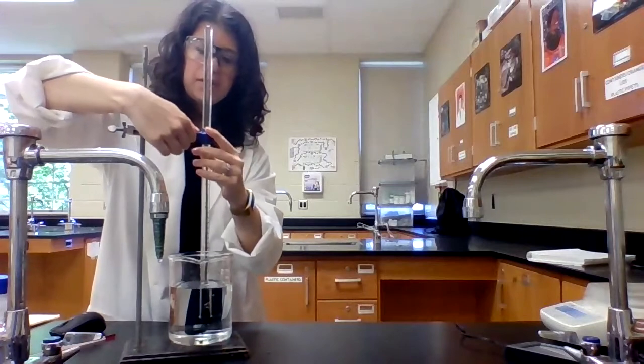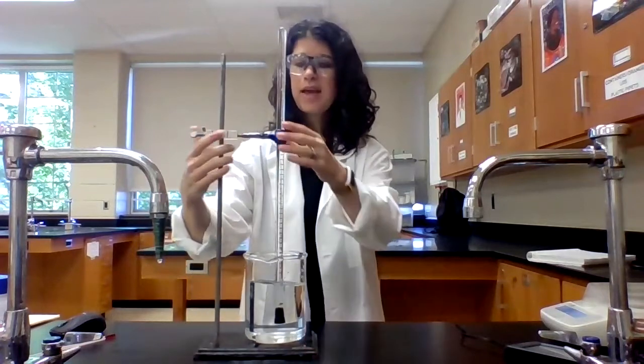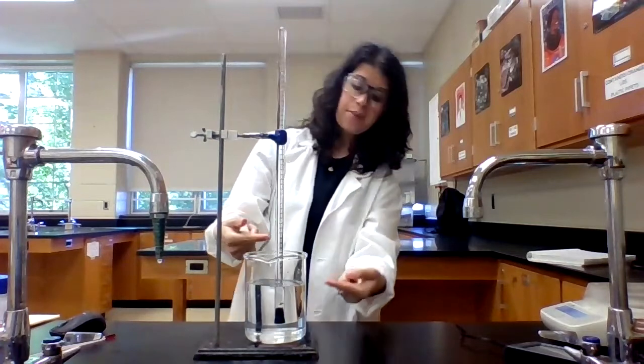Now you should notice that the position of the eudiometer is important. I don't want the bottom of it to touch the bottom of the beaker because again, that wouldn't let the water get out and that would cause a buildup of pressure, not a good thing. So what's happening now is the hydrochloric acid that was at the bottom of the eudiometer, again, being more dense than water, is now sinking back to the bottom, but the bottom is now here.